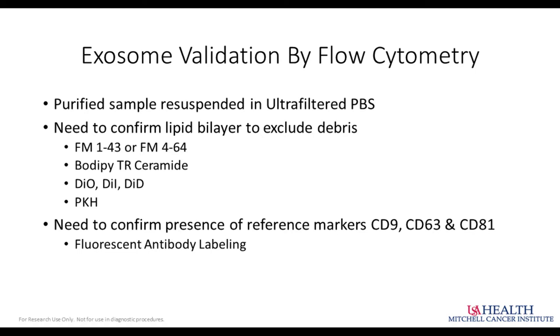So these might be small protein aggregates, but we've got to be able to exclude what would be true debris in that final spin versus true lipid bilayer vesicular particles. We do that using a lipophilic dye, which is going to allow us to really say that's a vesicle, that's not, and make that decision.